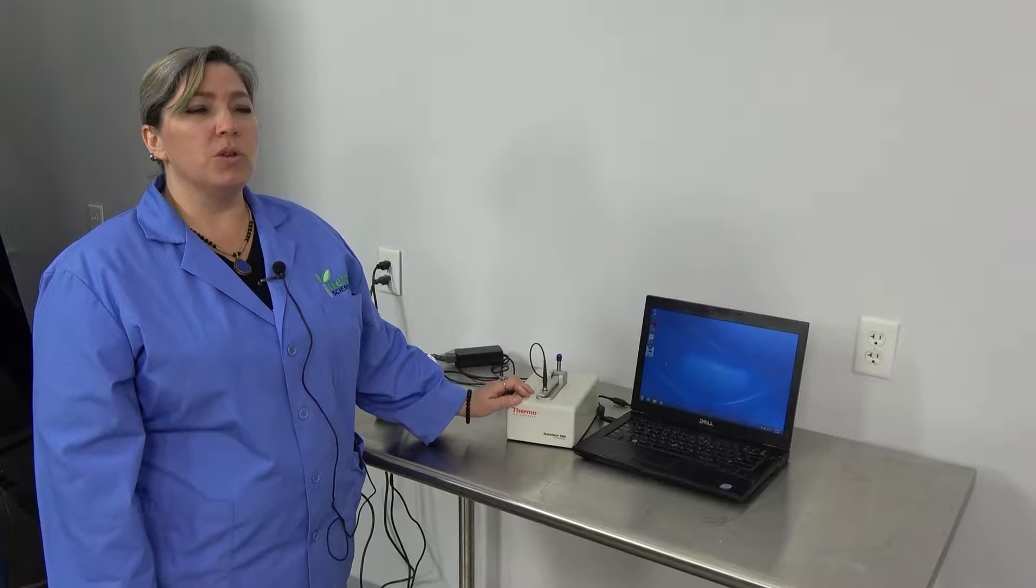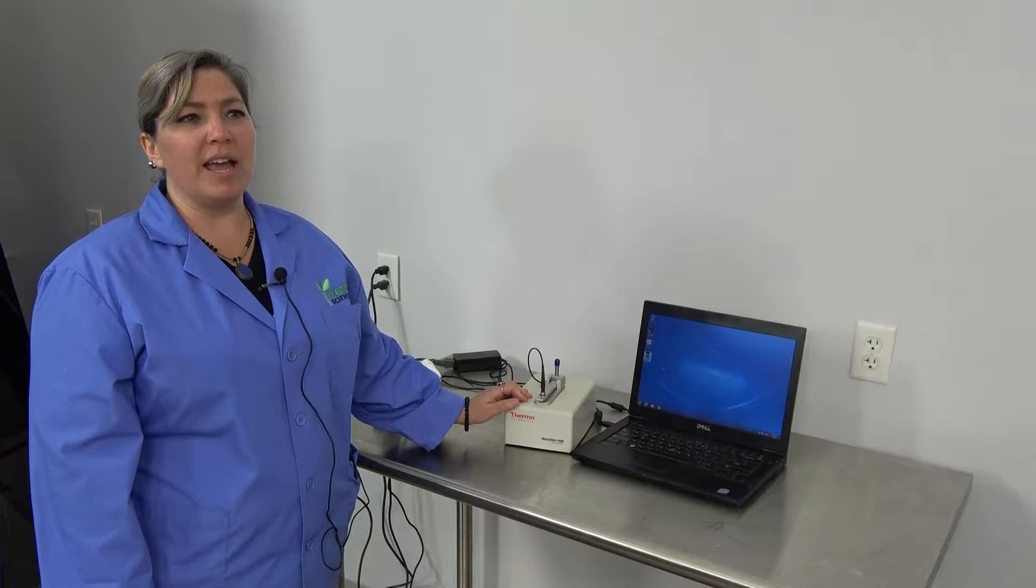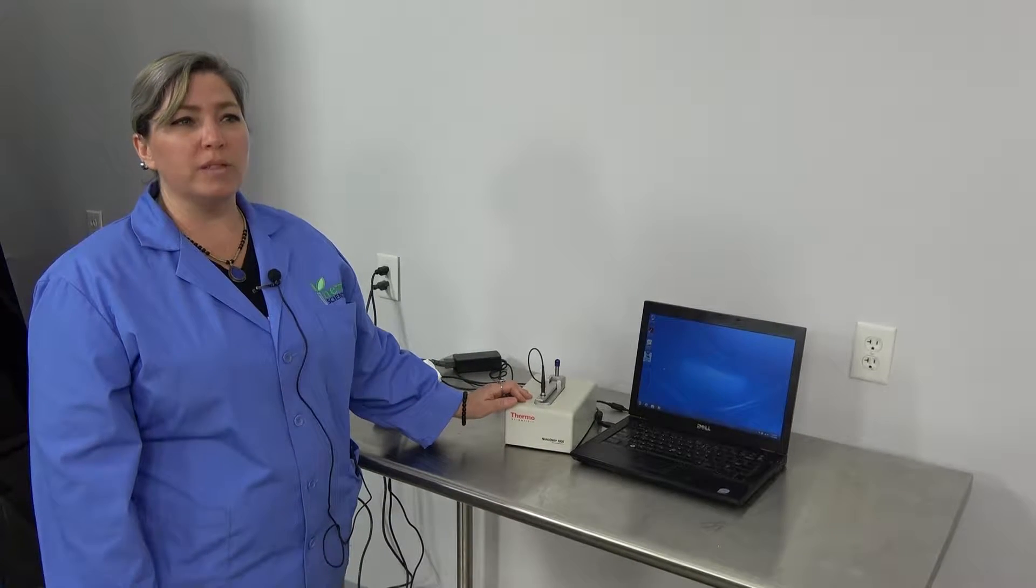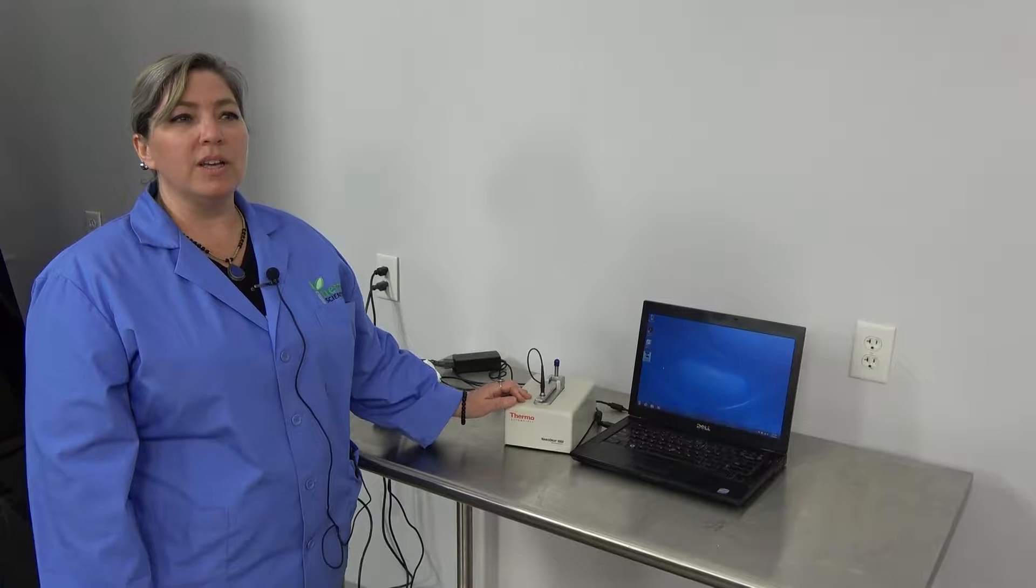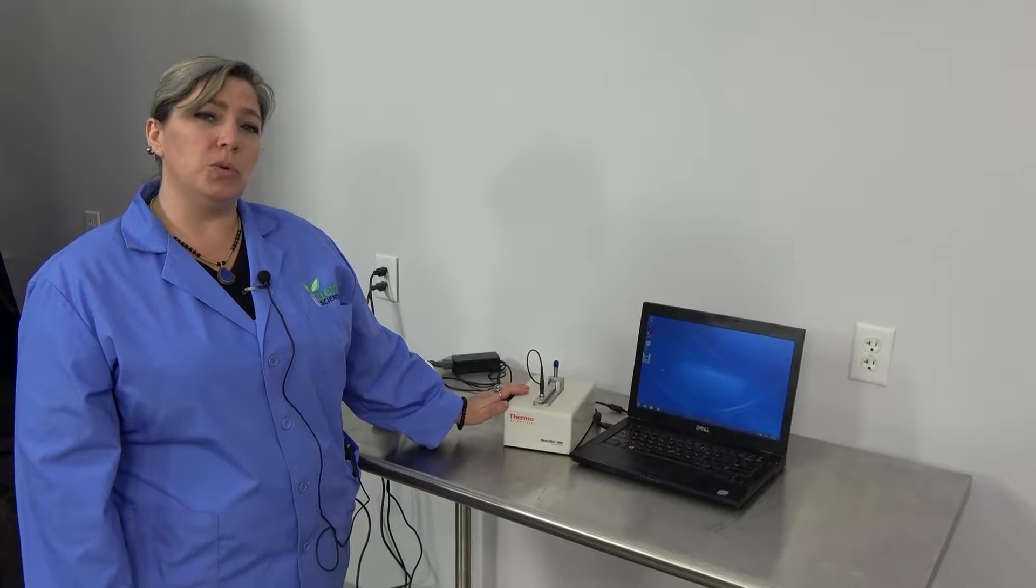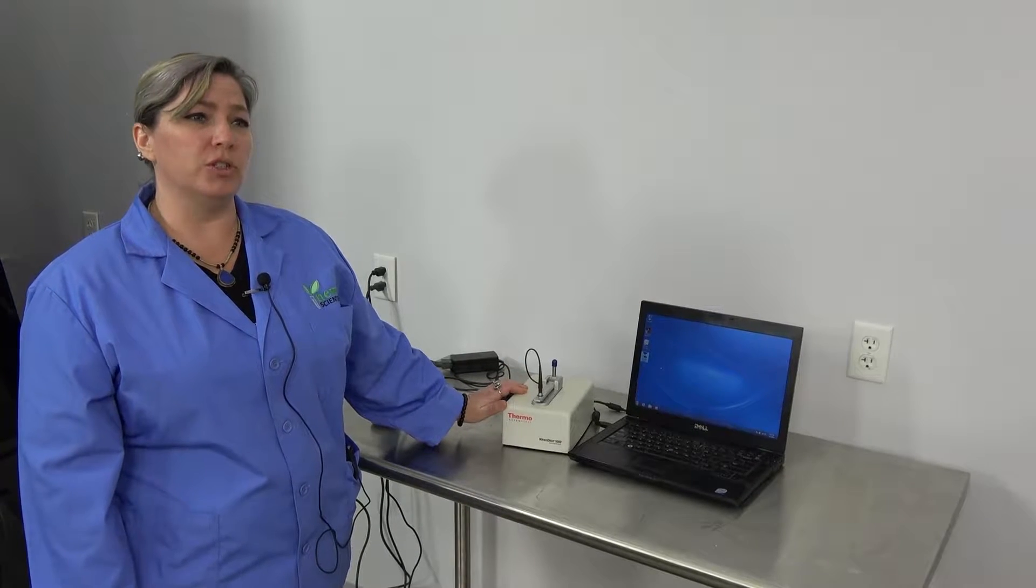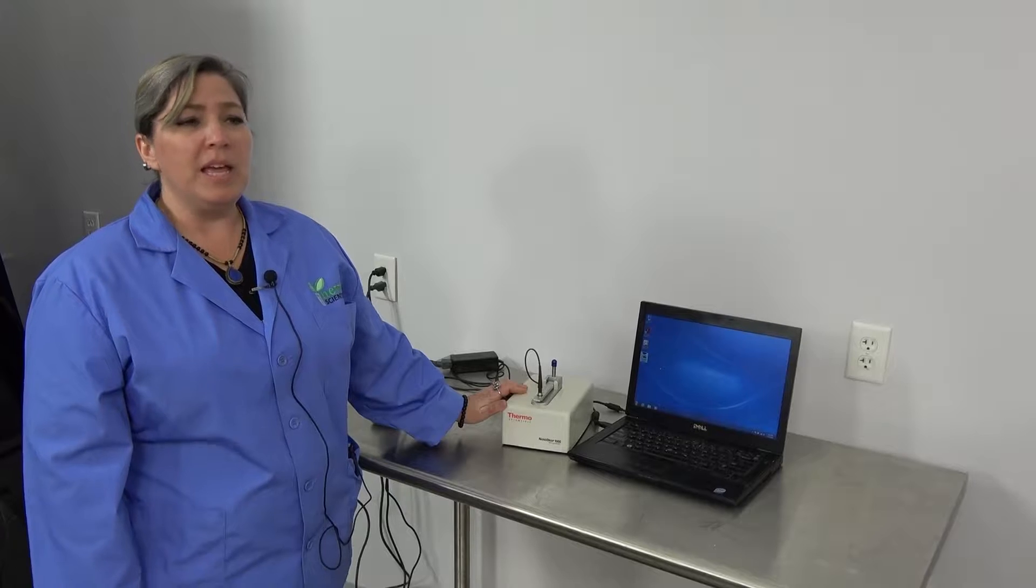You can get accurate nucleic acids, DNA, RNA, and protein quantification with only one to two microliters of sample in just seconds.